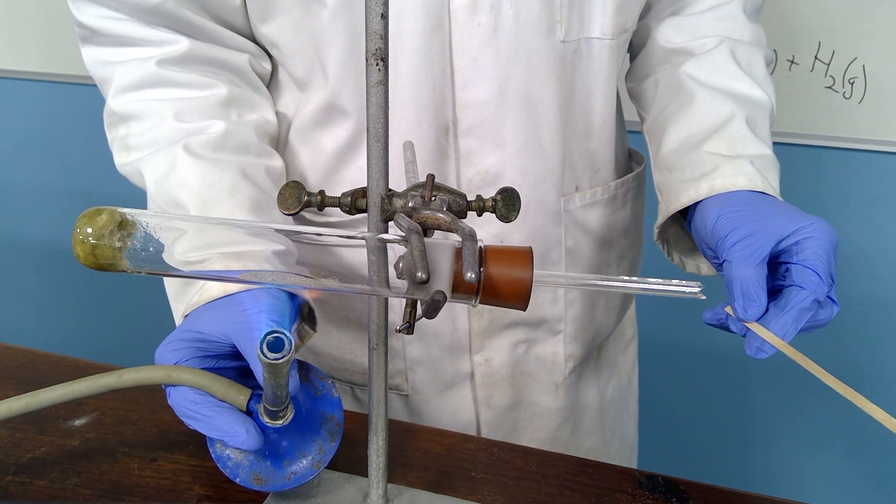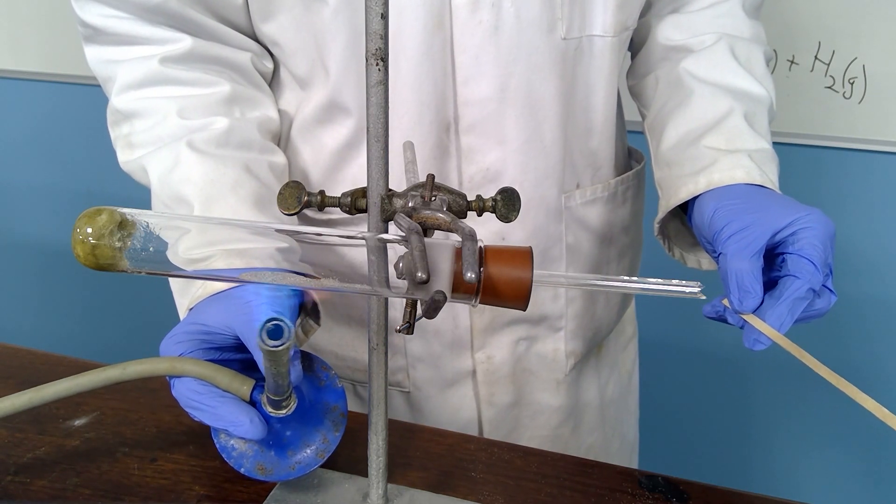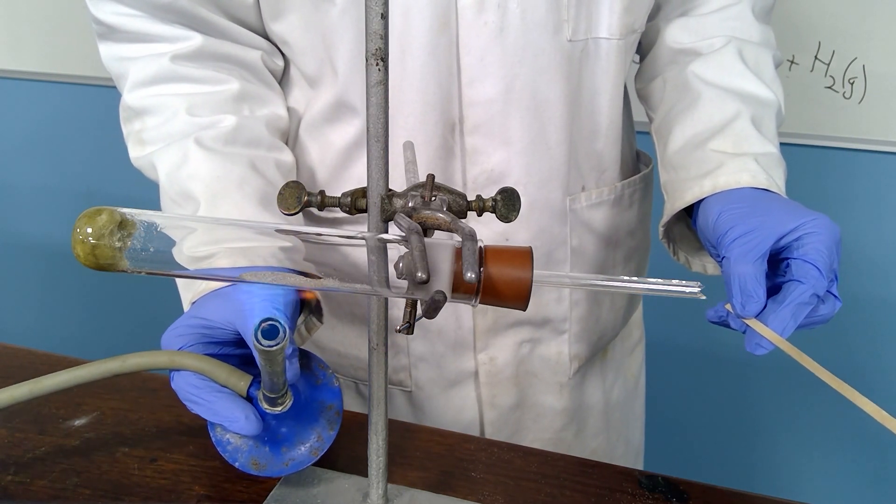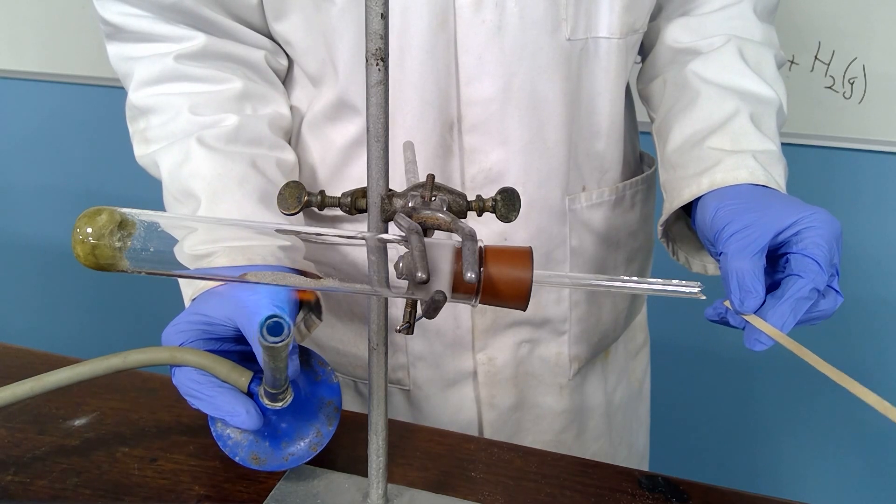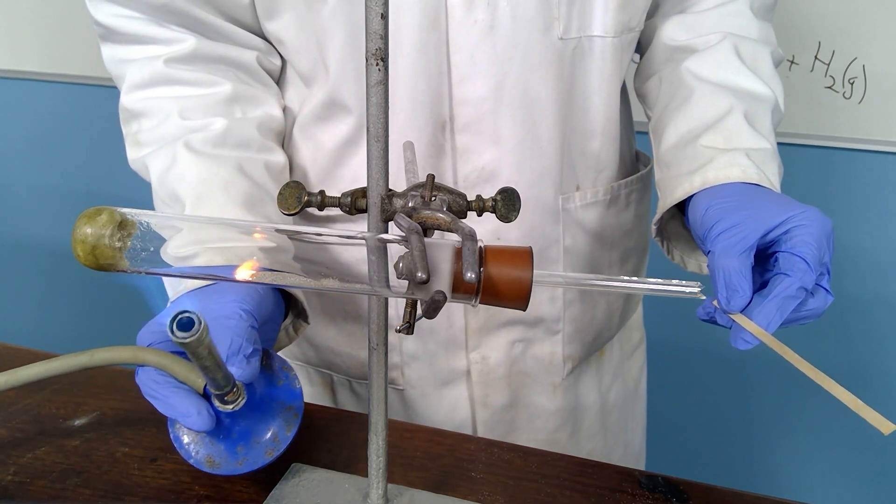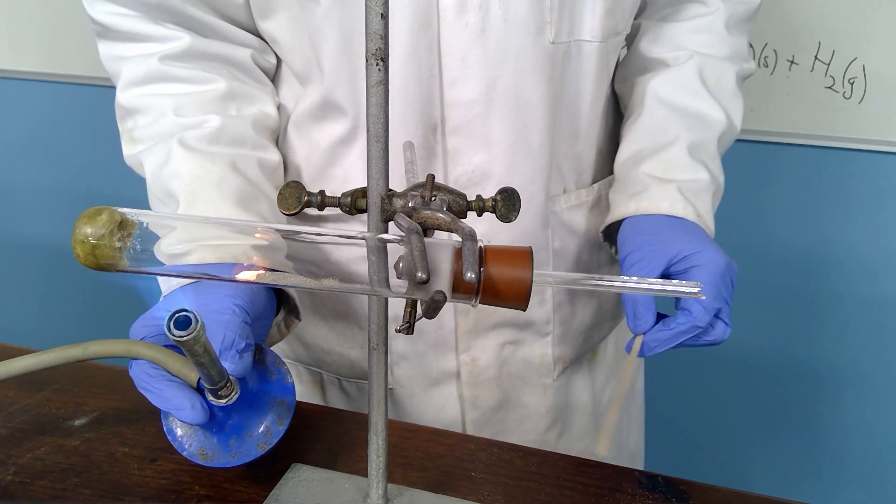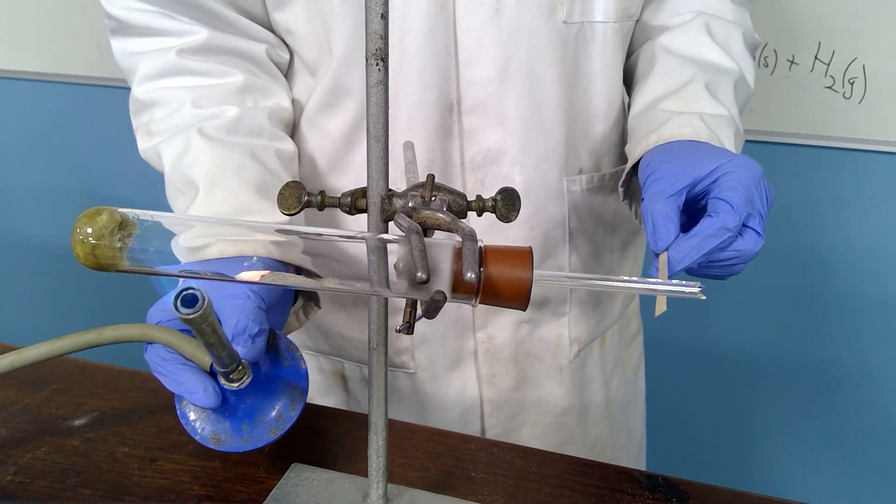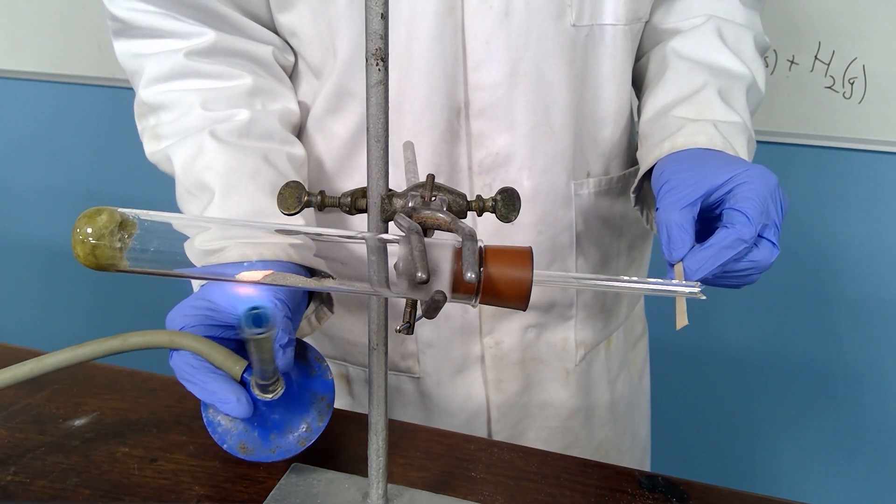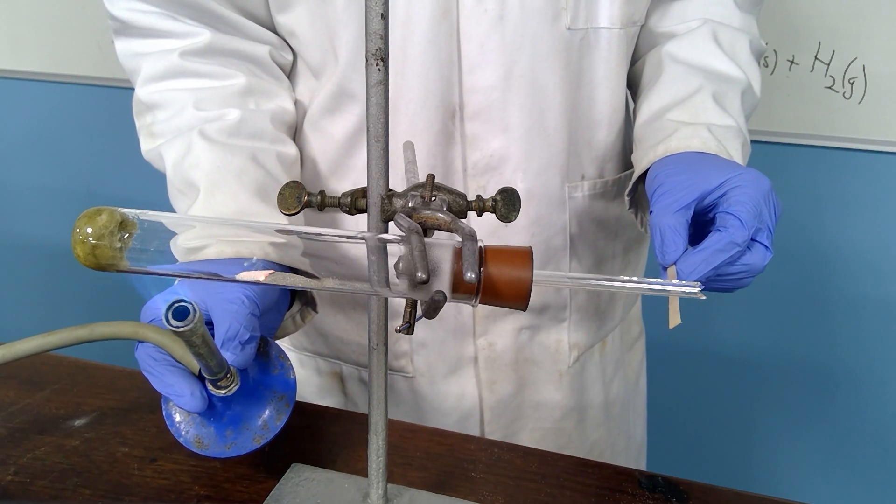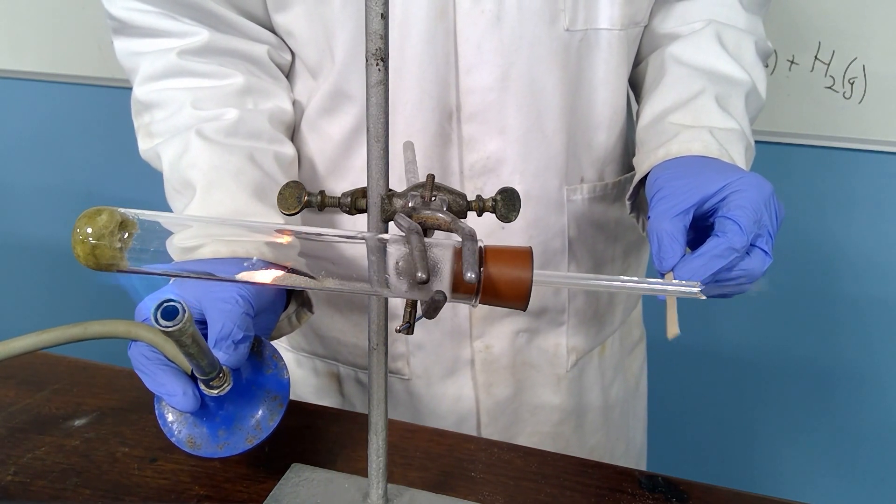As soon as I feel that the magnesium is hot enough, I will move the Bunsen down to the other end and start to vaporize some of the water. As I vaporize the water, a chemical reaction occurs. And there it goes.